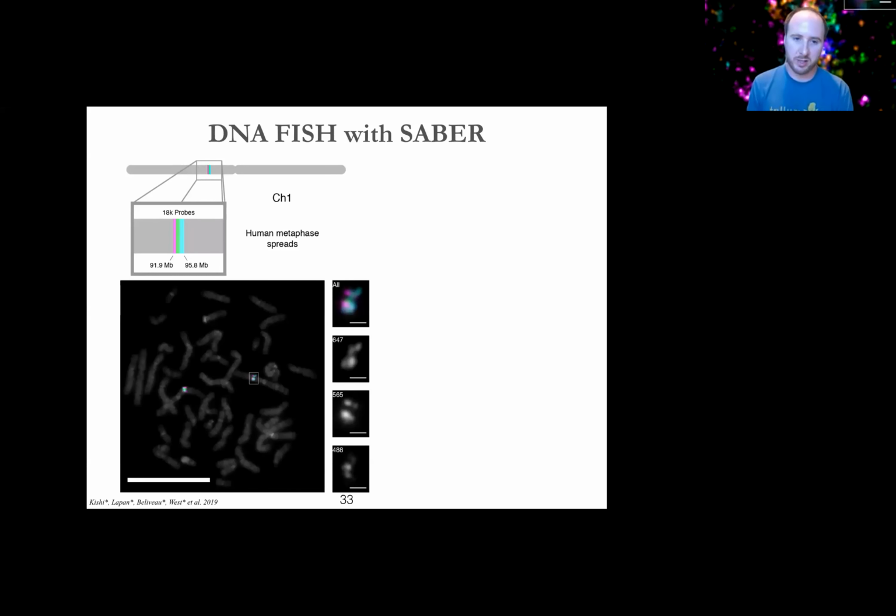Of course, for DNA FISH, we went to my favorite target, the metaphase chromosomes, where you can use the linear order of what you see and the type of chromosome you see it on to get great confidence that you're seeing what you expect. So here we ended up targeting about 4 megabases or so on human chromosome 1, and we get the expected co-localization pattern of these 3 colors. And we of course can also visualize this in interphase cells too.